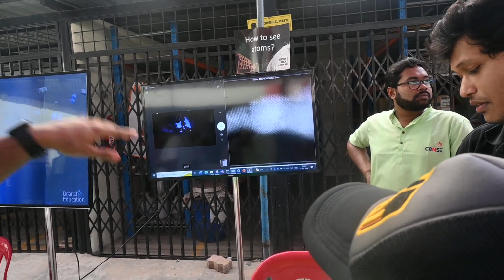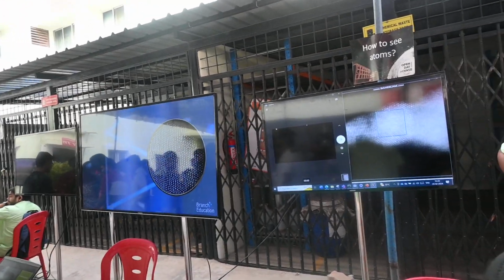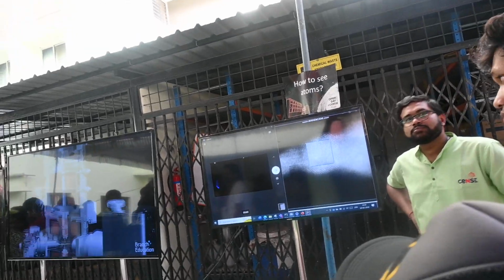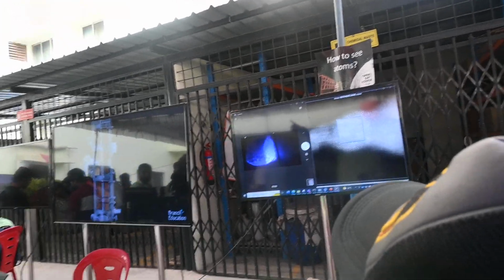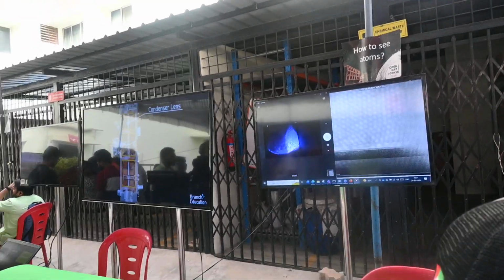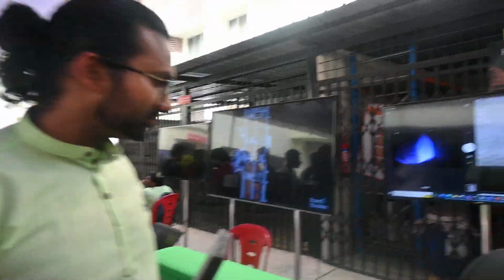Yes, this is just a recording. If you want to see the live feed of this, you can. So the instrument is behind this. It's like a 1.5 floor tall instrument, and the feed from that is being mirrored here. You can see it's controlled also. Okay, thank you, sir.